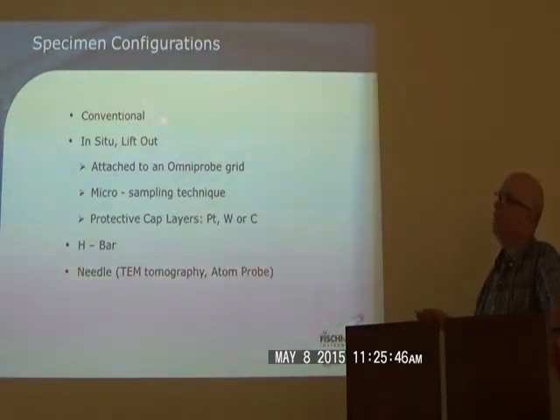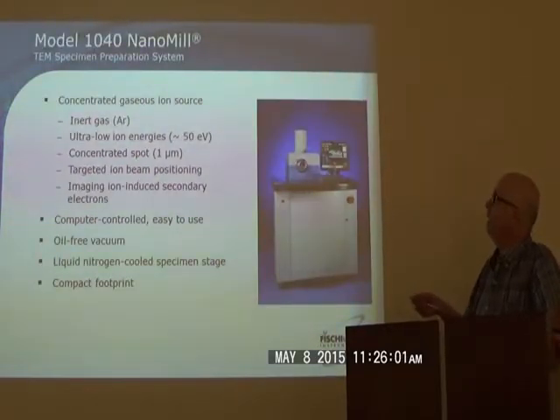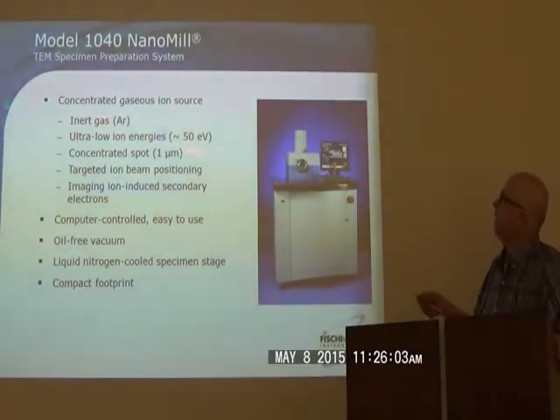As far as a FIB specimen or sample, if you aren't familiar with that, there are various types. In addition, of course, we have the conventional sample. Next slide, please.